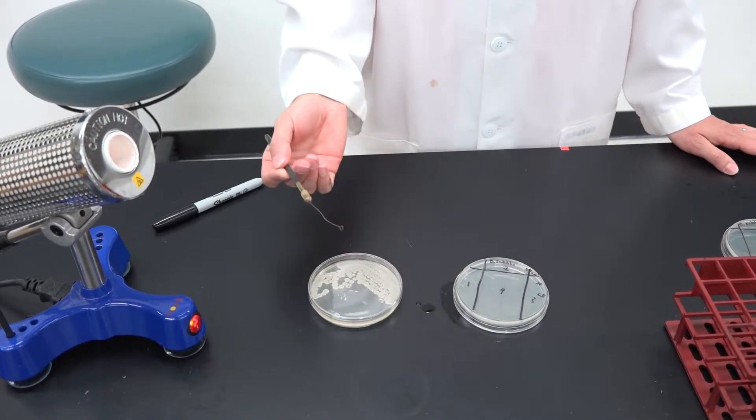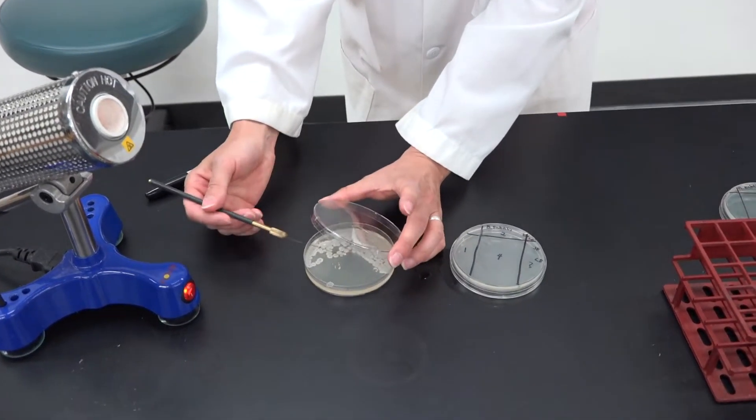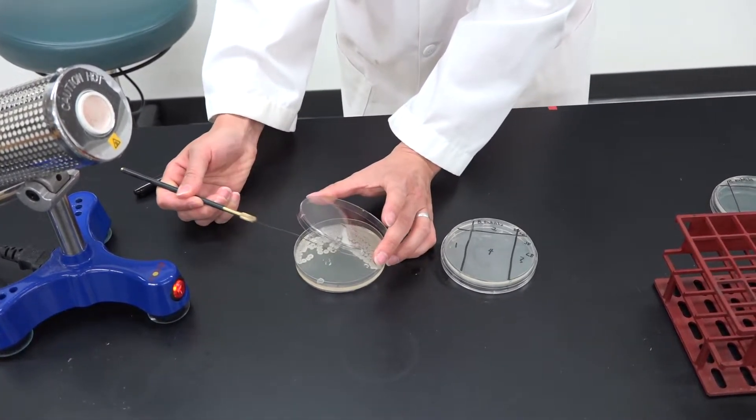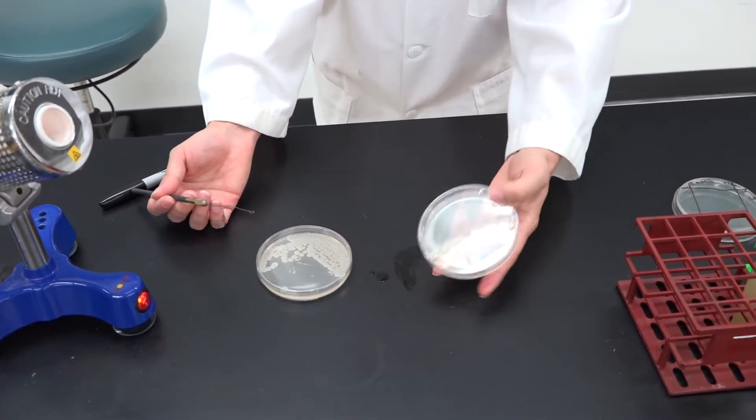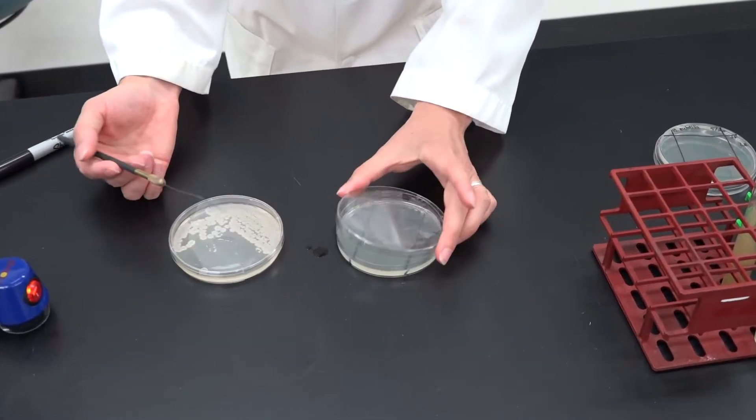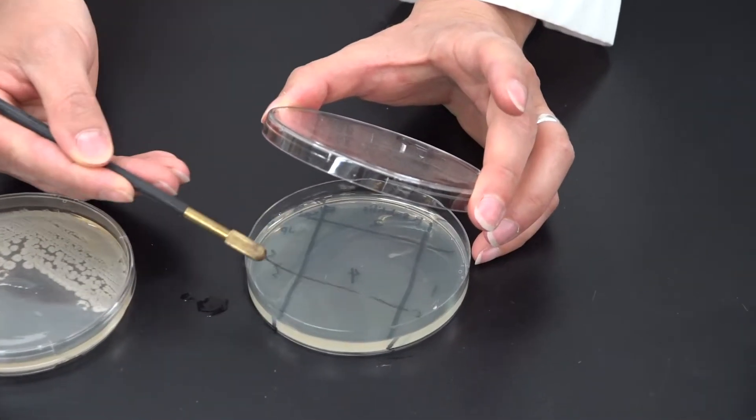You're going to start with a sterilized loop and pick a single colony from your plate. Open up the new plate and streak that colony into quadrant one.